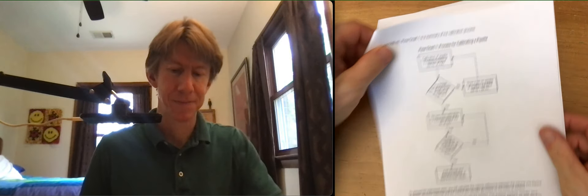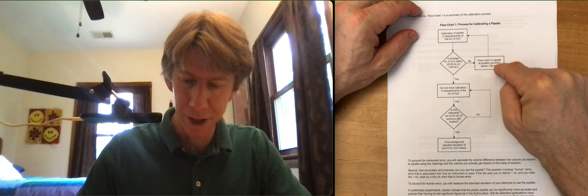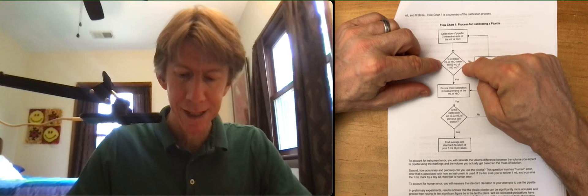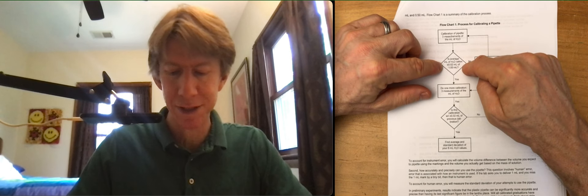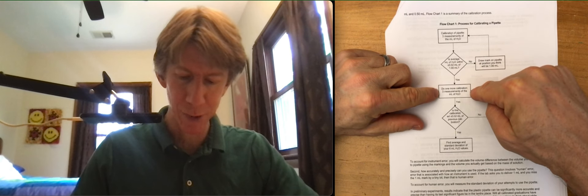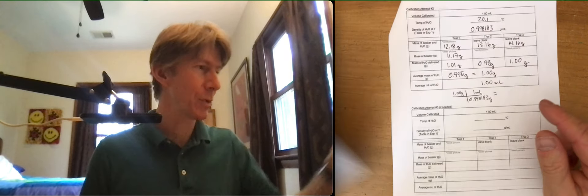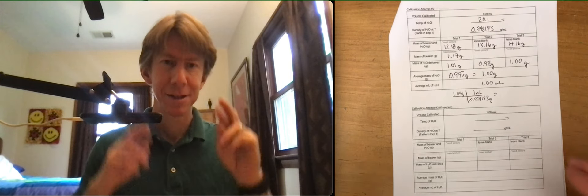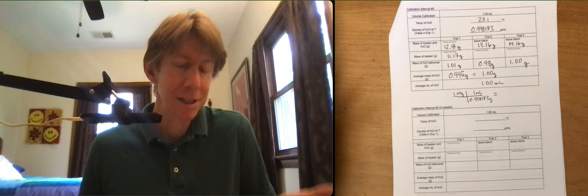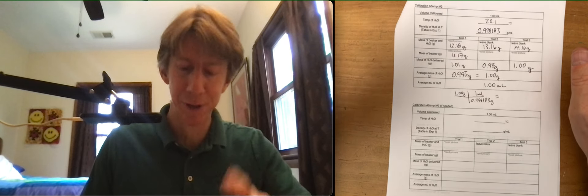Flowchart is our friend. All right, we said we drew a mark. We calibrate three measurements of the milliliters of H2O. Is it within plus or minus 0.02 of 1.00? Yes. Go down here. Do one more calibration with three measurements, and then we may be done. Have our fingers crossed, but we're in reality. It's okay, no matter how it comes out, because we're going to keep doing it until we get it right.